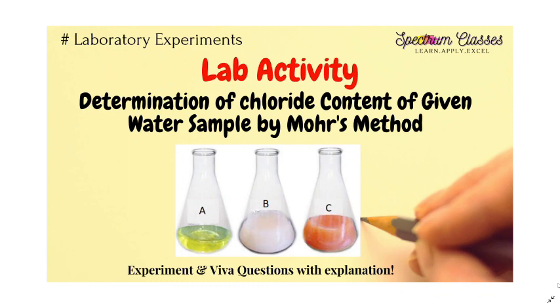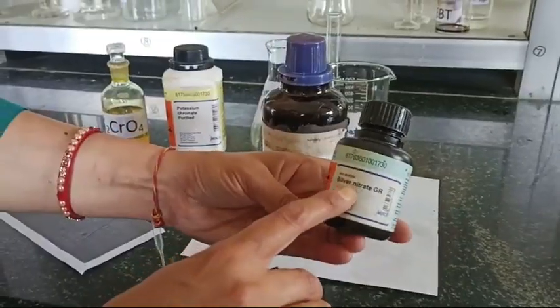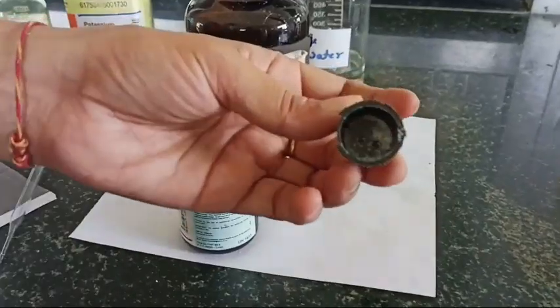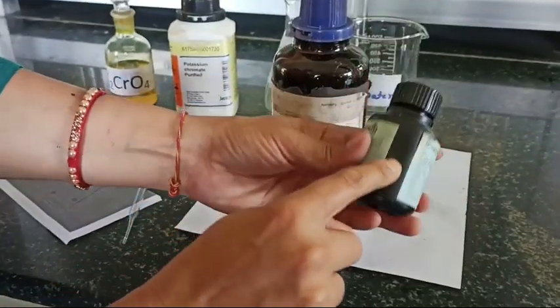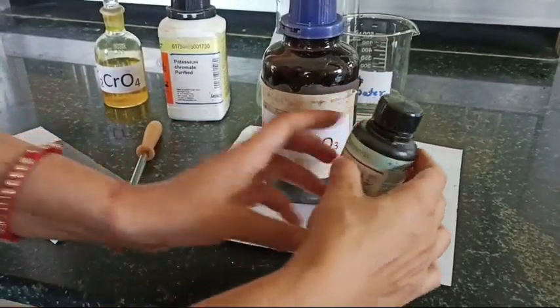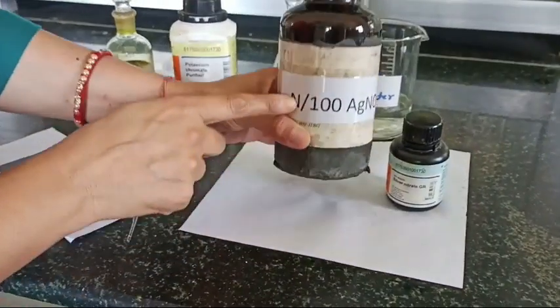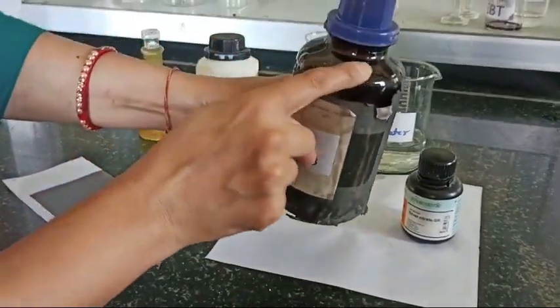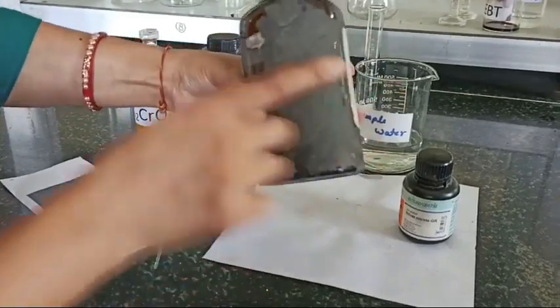Now let's start with the lab activity, and in between the lab activity I will tell you about the viva questions. Here is silver nitrate and this is how it looks like. It is kept in this kind of bottle. This is N by 100 silver nitrate solution and we kept this in brown bottle because this is photosensitive, so light can affect silver nitrate.